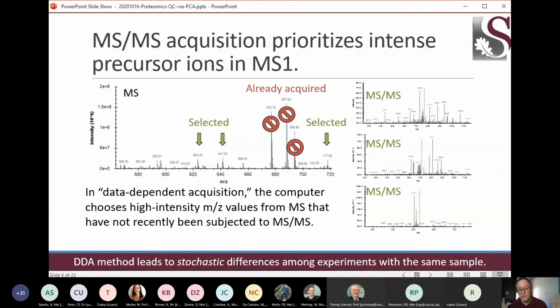So that might seem very, very complete, that we're getting a great sampling of anything that shows its head in a mass spectrum. But the reality is that a great many of these peaks that appear in a mass spectrum are there and gone. There might be very, very little of them, and so they only appear for sampling in a single mass spectrum. If the instrument fails to select it at that time, that peptide is lost to us. So it may be that we're getting a reasonably good capture of tandem mass spectra from the peptides because it's a very simple mixture, but the reality is almost every proteomic experiment has far more peptide ions that create a peak at some point than we actually observe through tandem mass spectrometry.